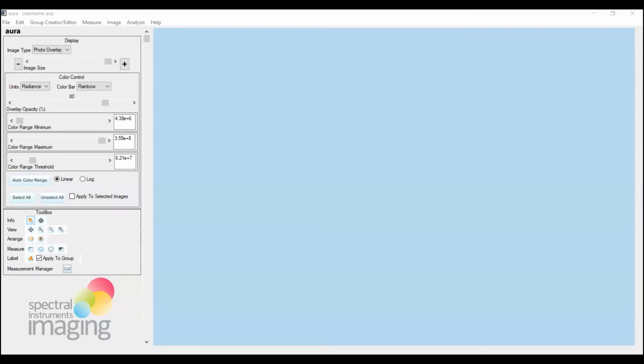Now, what we're looking at here is the homepage for the analytical version of Aura. And for any of you who have recently taken images on your AMI HTX or LagoX systems, you'll note that there is no acquisition ribbon here along the base of the homepage. Now that's absolutely fine because all we're doing here today is image analysis, so that feature is not needed.